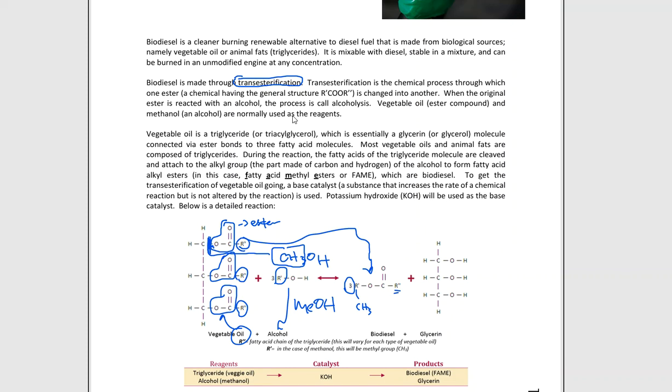And this is what we call our biodiesel. It is a group of not quite hydrocarbons, but carbon-based compounds, so organic types of compounds, that all have ester groups on them, and these can be used to give us energy, and these can be used in order to move some wheels on a vehicle, or do other purposes, whatever you decide to do with it.